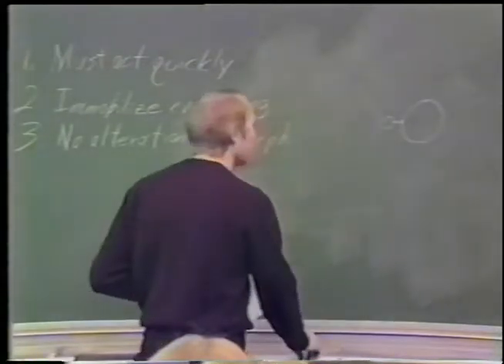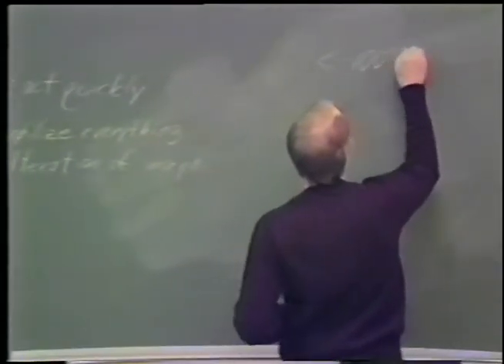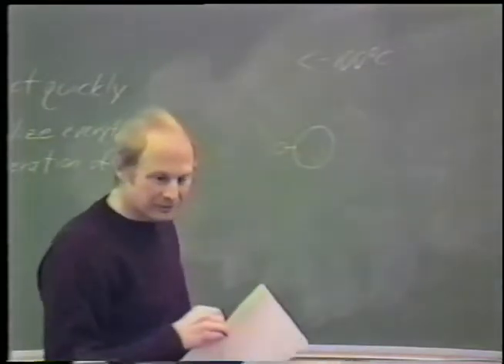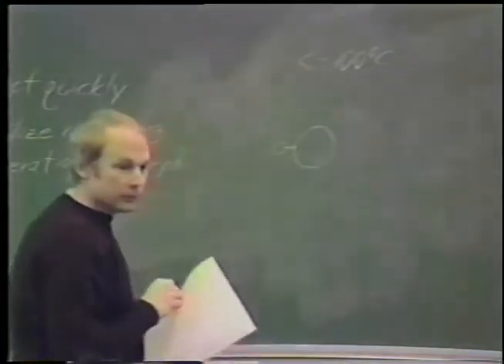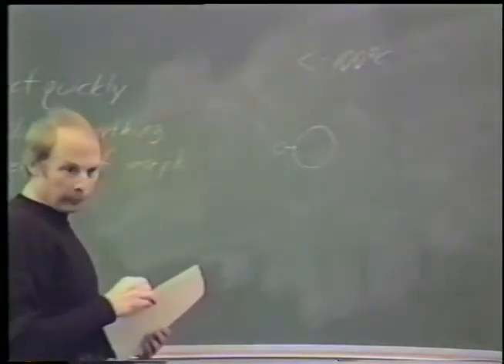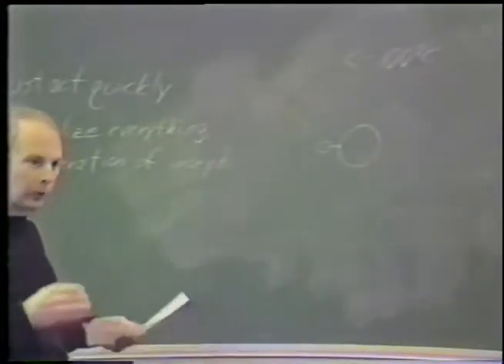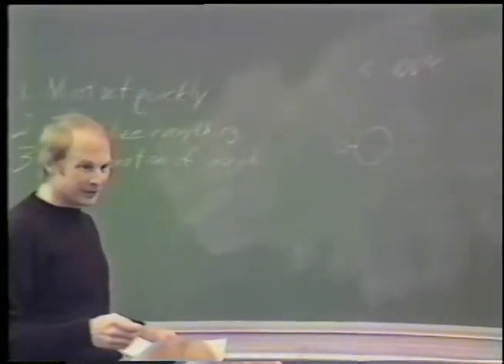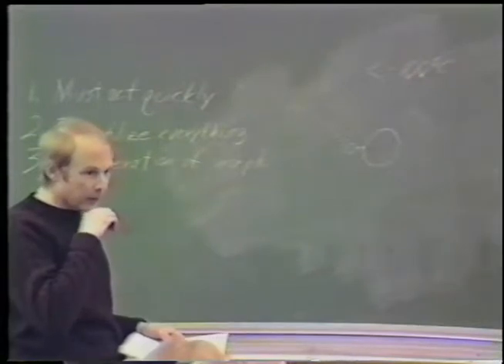Now, it used to be thought that you had to keep samples below minus 100 degrees centigrade in order to... I'm sorry, I interrupted, but when is it that you have to have ultra-cool forceps? When are you going to touch these things after they're already frozen? You are going to have to move them at some point. You have to move them into your double replica device for freeze fracture, or manipulate them for freeze substitution. At some point, you're going to have to touch them. Well, they're in a frozen basket. Generally between sample carriers. But okay.